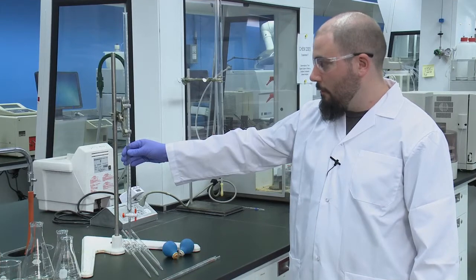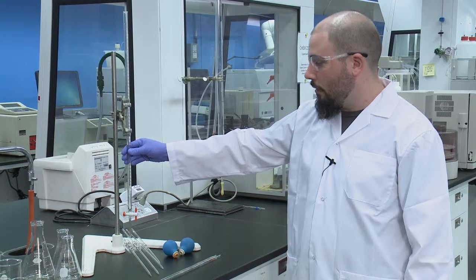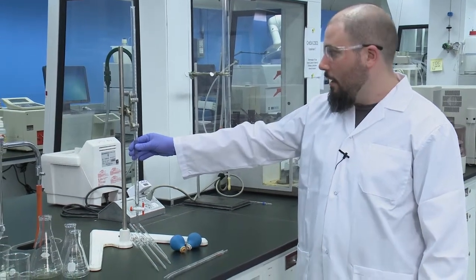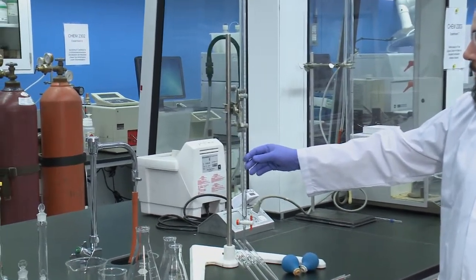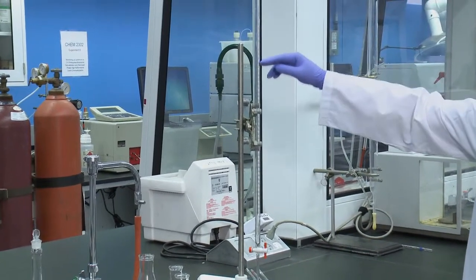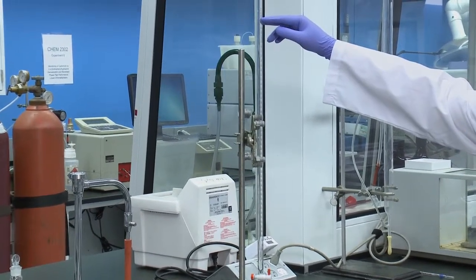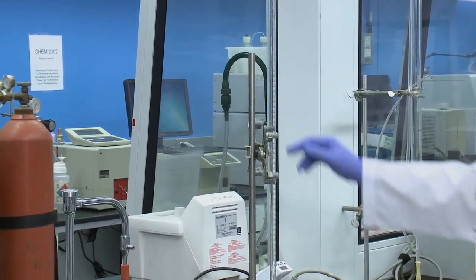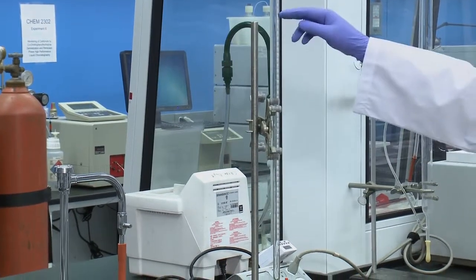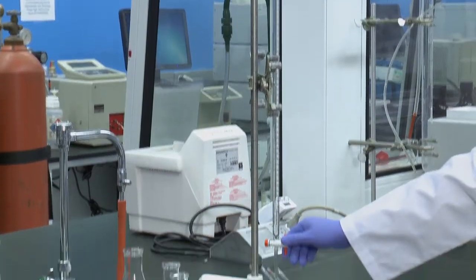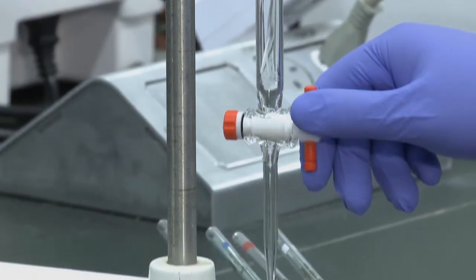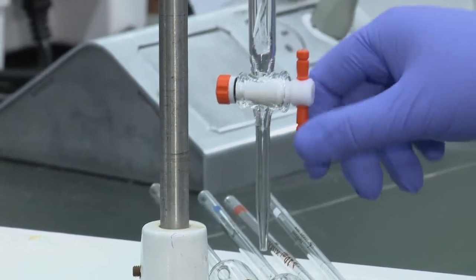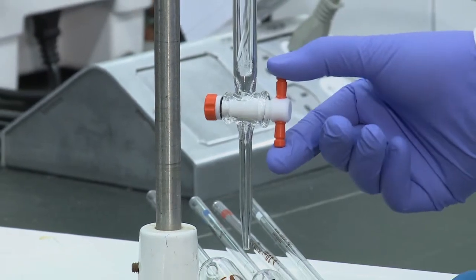On this stand we have a burette which is commonly used for titrations and is a good way of putting accurate volumes in. You always begin at any of these lines and the volume you put into your flask is the difference between where you begin and where you end, using this Teflon stopcock to control flow rate. Each burette comes with a stopcock located at the bottom which is used to control flow rate by how far you turn this piece.